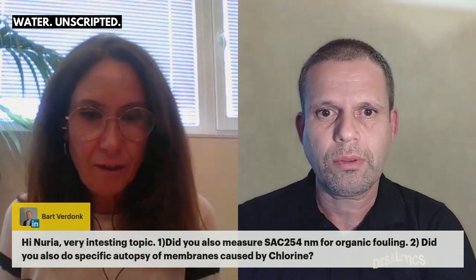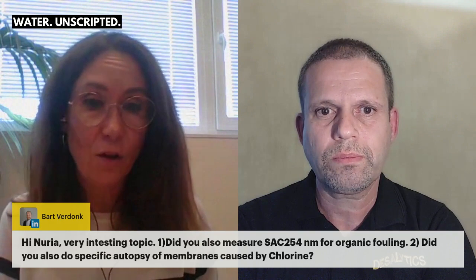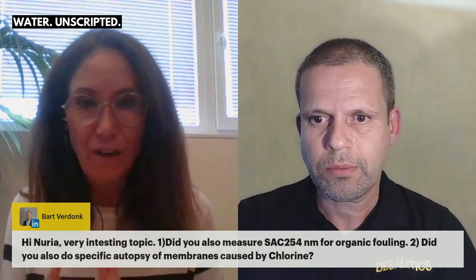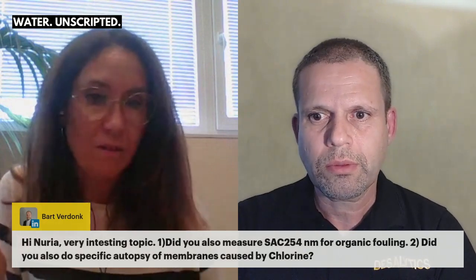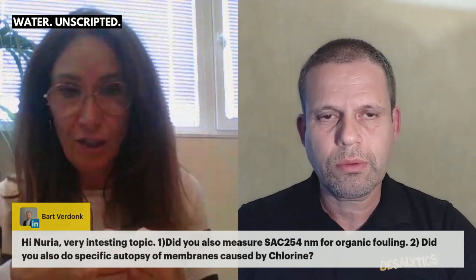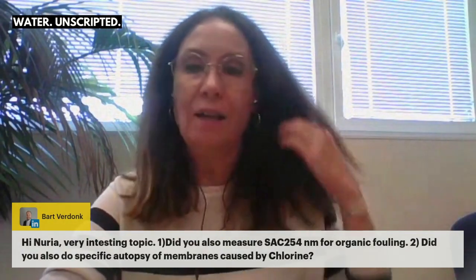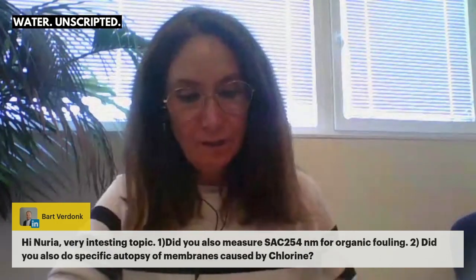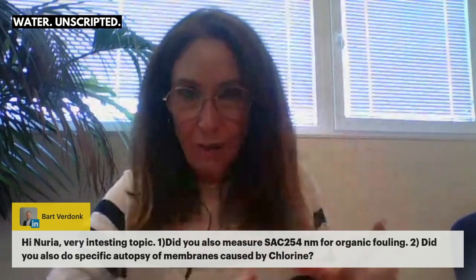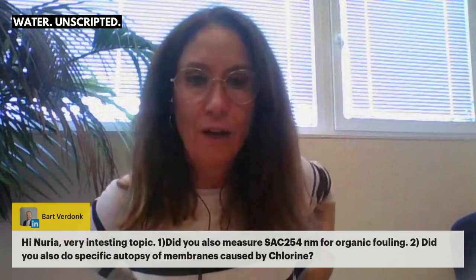We don't measure that UV measurement on organic fouling. It's something that is commonly measured in water, but not for organic fouling. We really look to know how much there is of an organic component. For example, consider that the foulant is a solid, so we commonly make loss on ignition or thermogravimetric analysis, which are based on the temperature degradation of certain components to determine the organic component as a global concept, but not its measurement at 254 nanometers.